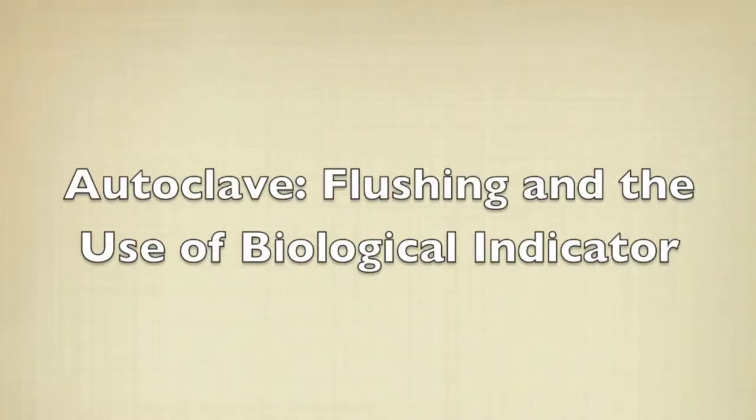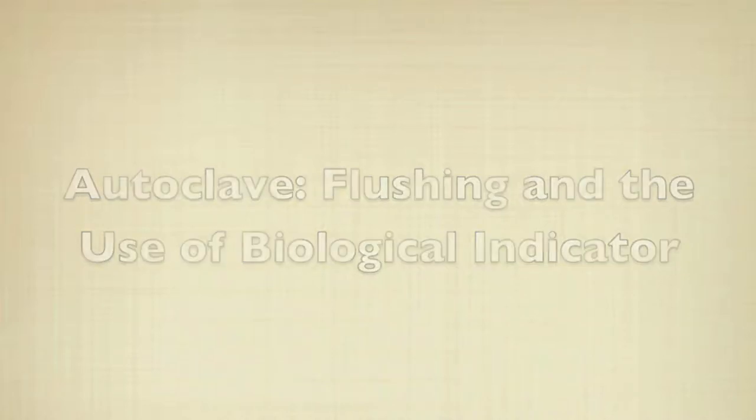This video will demonstrate how to flush the autoclave as well as perform a biological indicator test when running the autoclave. Prior to turning on the autoclave, it's always good practice to flush the steam boiler first.